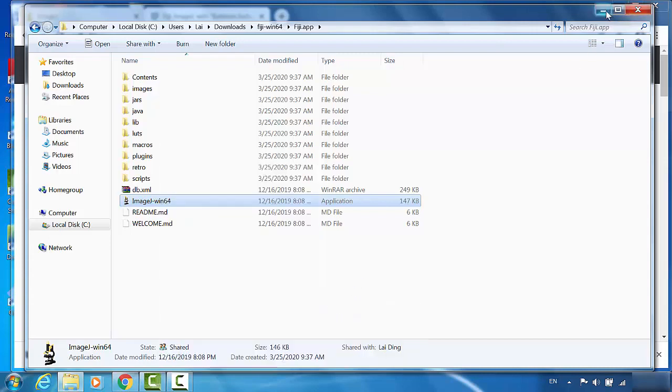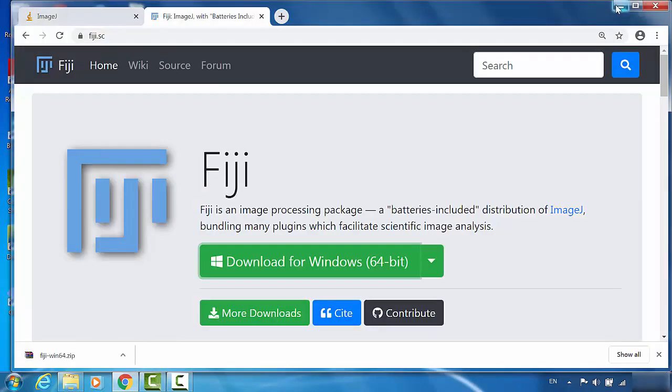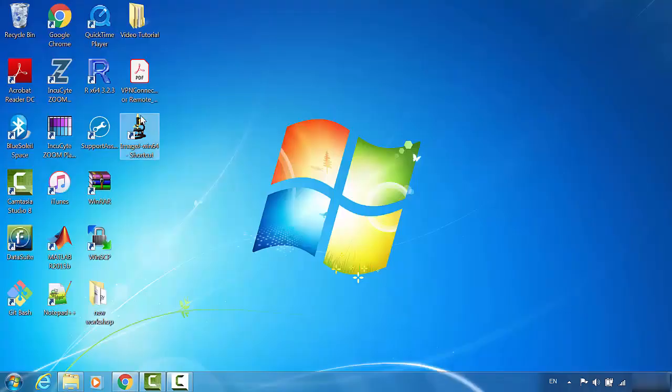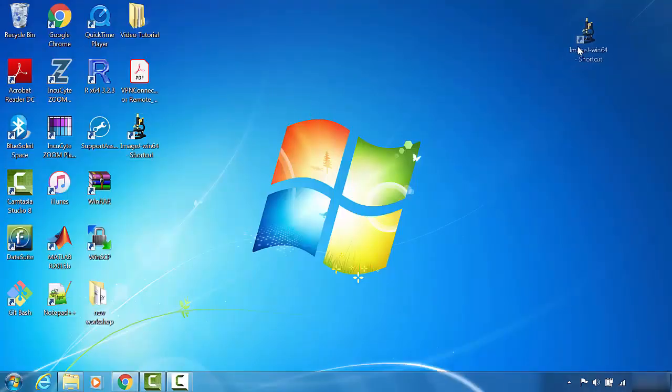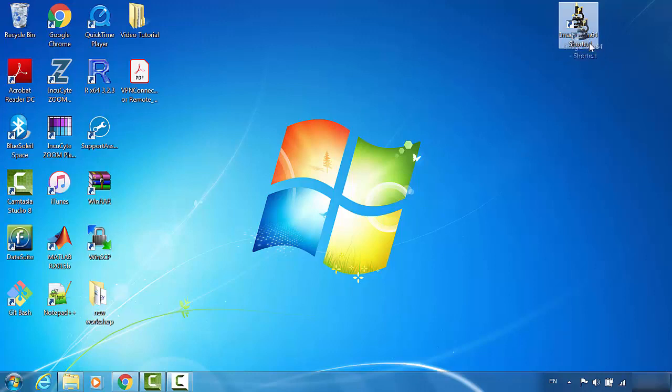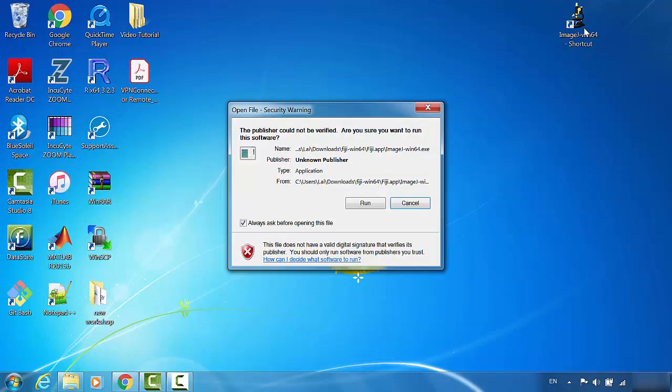Let's minimize this. So this one is the logo for Fiji ImageJ. At this time, we can just double click it.